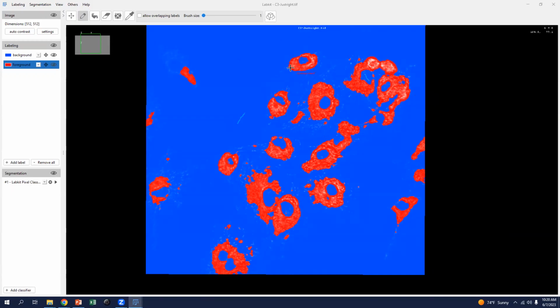And the larger your file is, the larger your image is, this can even work on a 3-dimensional stack to segment structures you see inside. But the larger the image, the longer it will take. And it's not a linear growth. Like an image 4 times as large may take 16 times as long to process.